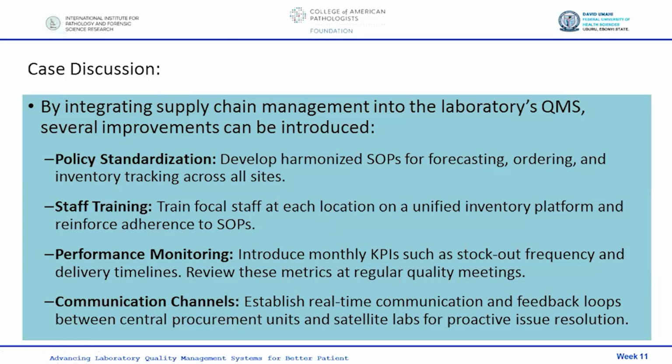It is important that training of staff is done, especially the focal staff at each location, on a unified inventory platform, if you're using a digital inventory management system. And also, it is important you don't just stop at training them, you reinforce adherence to SOPs. You make sure that they adhere to the SOPs.